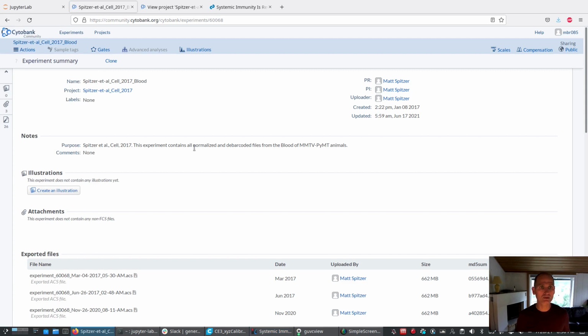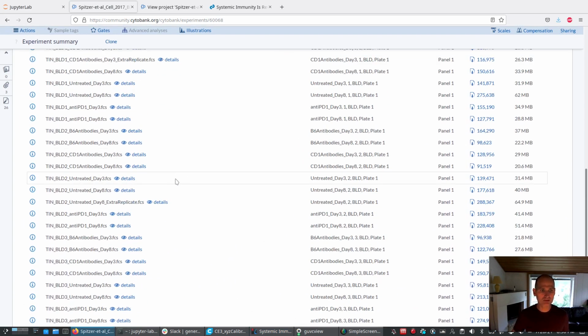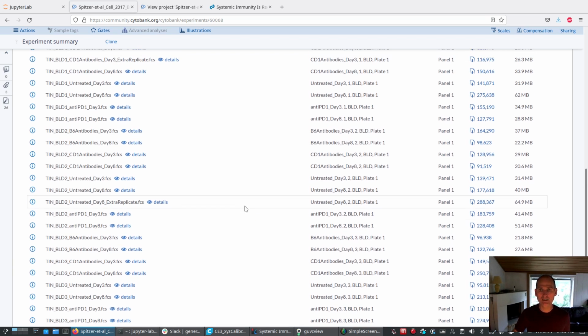So what is the data we have here? I can go back to the experiment. We have a number of FCS files. I think it's 26, with roughly 11 million events in them. The titles suggest that there are different conditions in each of the samples.